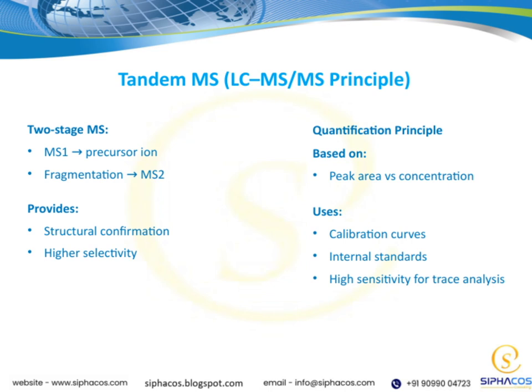We also incorporate internal standards. These are compounds added in a constant amount to all samples and standards to improve accuracy and compensate for any variability during analysis. The method offers high sensitivity, making it ideal for trace analysis where detecting very low concentrations is crucial.